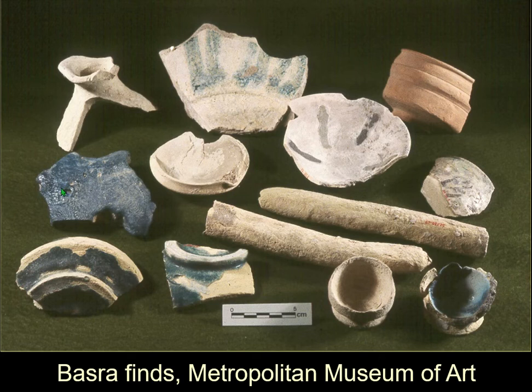And this is blue glass, which I would assume, since it's a pottery production center, may be glass for making glass, but it could be for coloring pottery, painting pottery. So this is evidence for production at Basra. So when we thin section evidence for production, we are characterizing production at that site, which is very useful. So the association of this fabric to Basra is 100% certain.